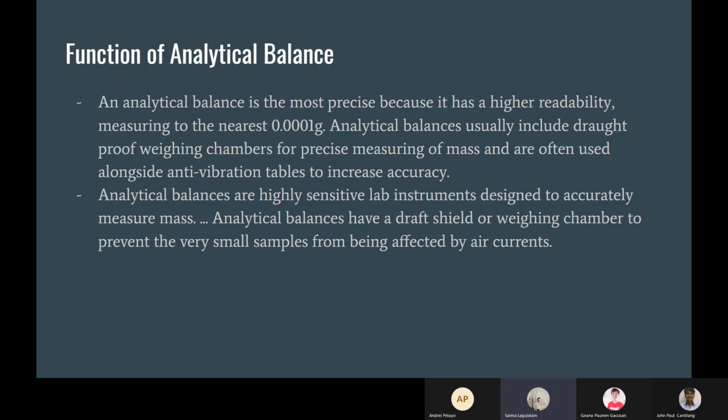Analytical balances are highly sensitive lab instruments designed to accurately measure mass. Analytical balances have a draft shield or weighing chamber to prevent very small samples from being affected by air currents.